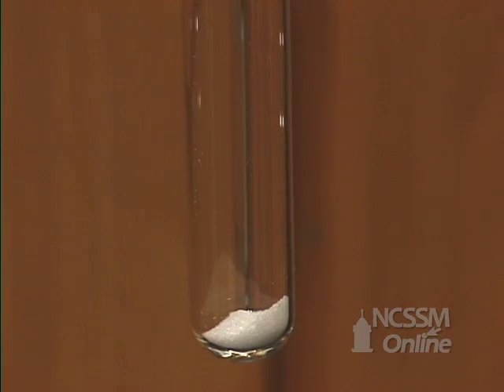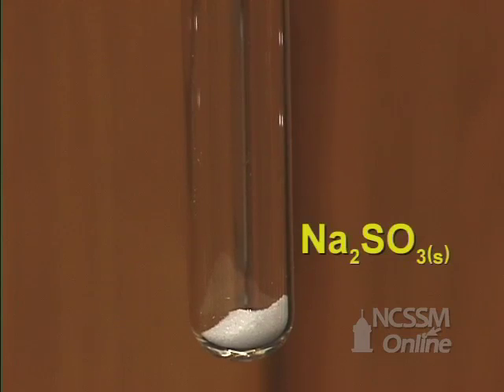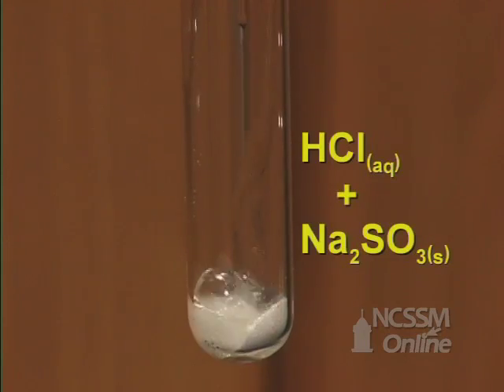In the double displacement reaction of a metal sulfite with an acid, we will start out with white sodium sulfite and add an aqueous solution of hydrochloric acid.